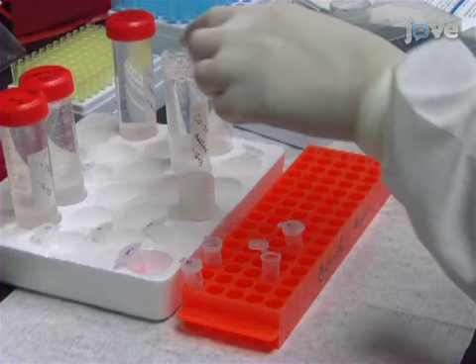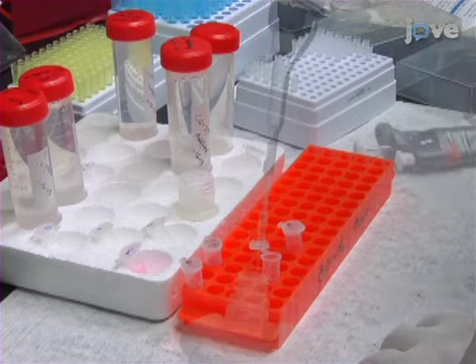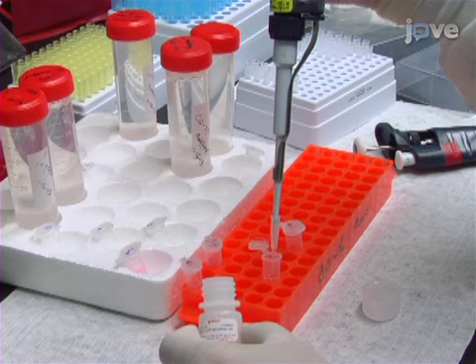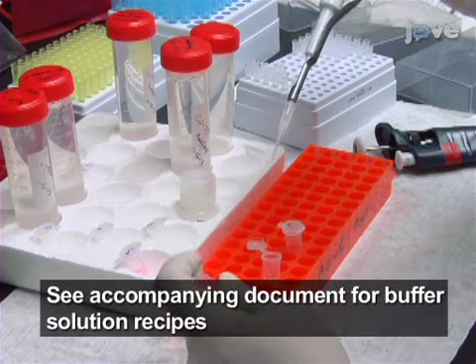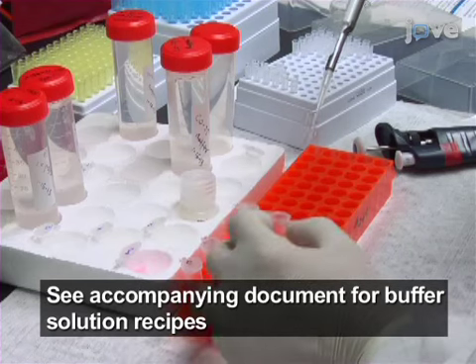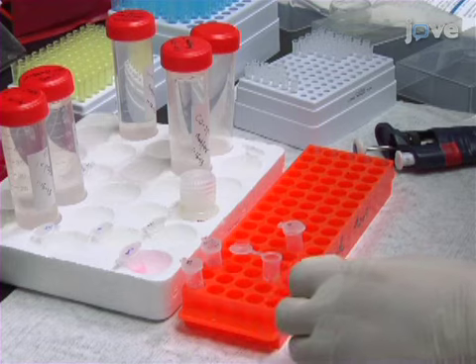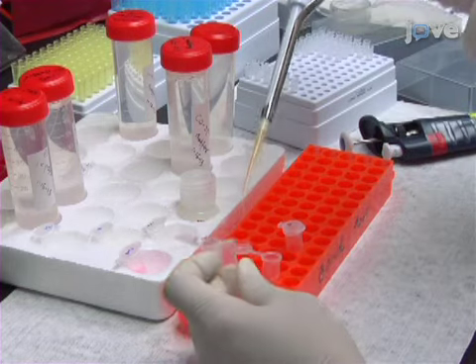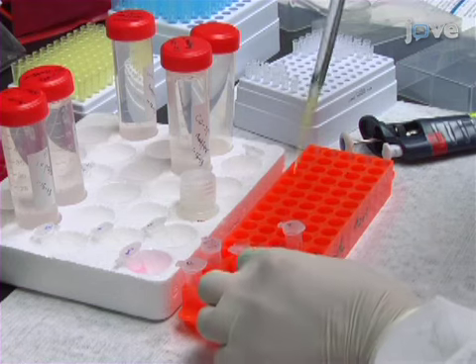After determining the protein concentration, add 1 milligram of lysate protein and 1 microgram of either the SMR wild type or SMR mutant peptide to 20 microliters of anti-flag M2 affinity gel. This affinity gel is hereafter referred to as the resin. Bring the mixture to a final volume of 1 milliliter in co-IP buffer.